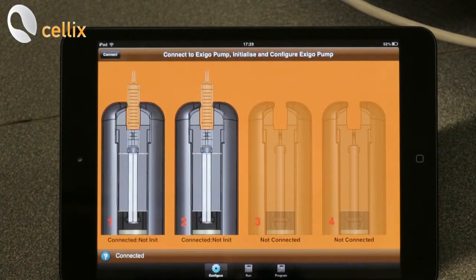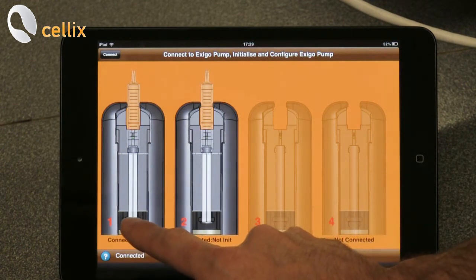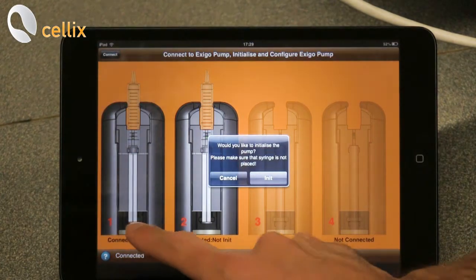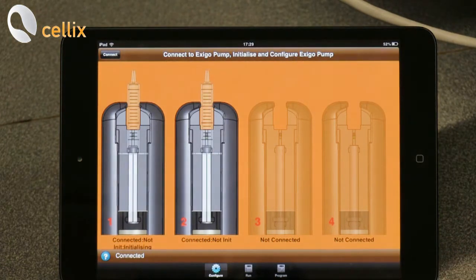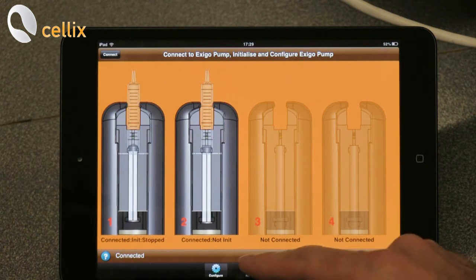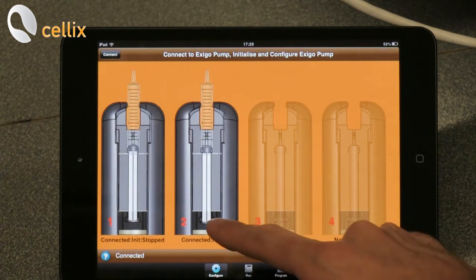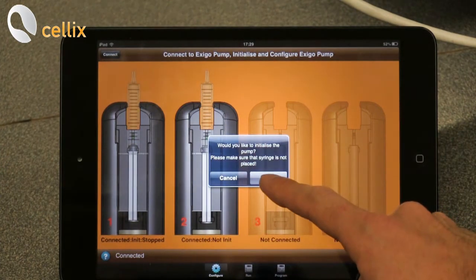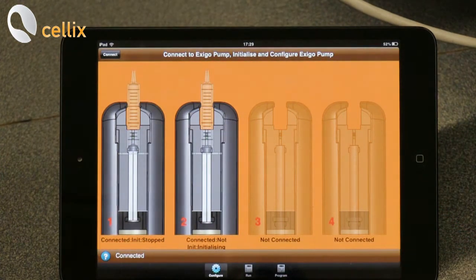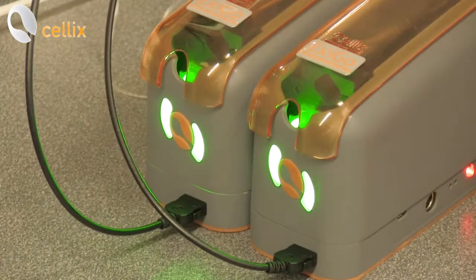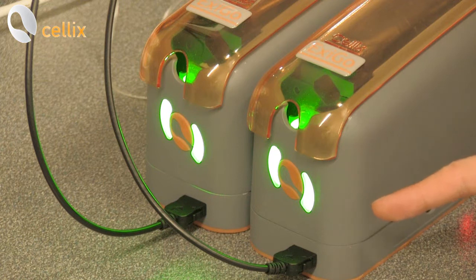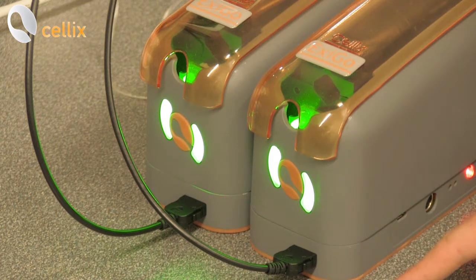So in order to be able to use the pumps we have to initialize them so we click on the syringe guide here and we click initialize. We do the same operation for the pump number two. Double click, initialize. We can see the green lights in front of the pumps. This means that the pumps have been correctly initialized.